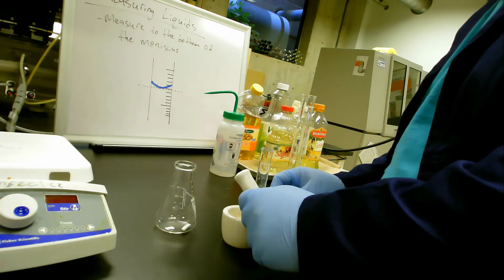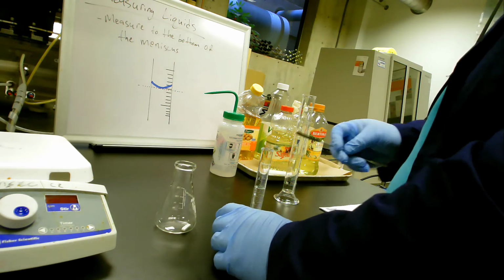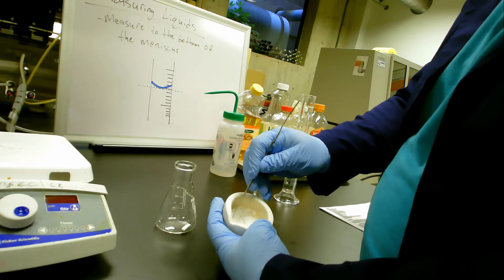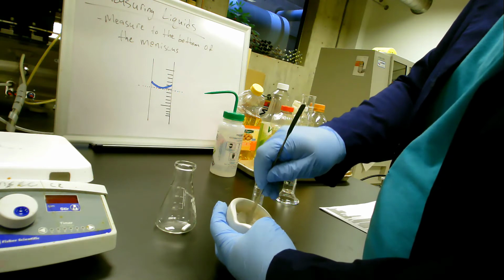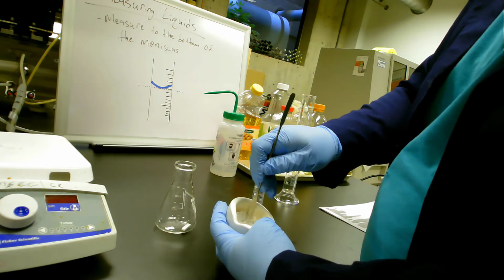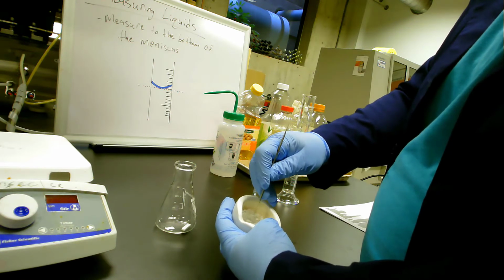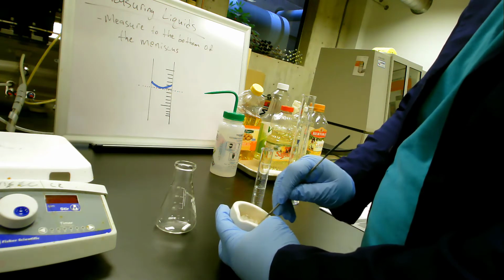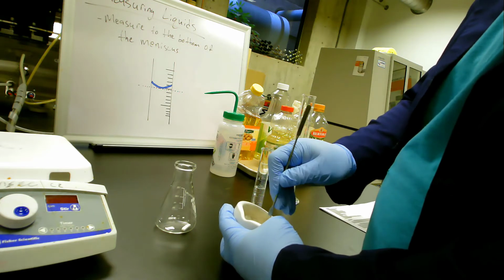After grinding the sodium hydroxide, a lot of the powder will be stuck to the mortar and the pestle, so we're going to use a spatula to help us try and scrape out as much as we can. Once we've scraped as much as we can into the Erlenmeyer flask, we're then going to use the methanol that we measured out to help rinse off and dissolve some of the residual sodium hydroxide into the flask. This is another reason why it's not such a big deal that we over measured our sodium hydroxide a little, because we always lose some in this step.